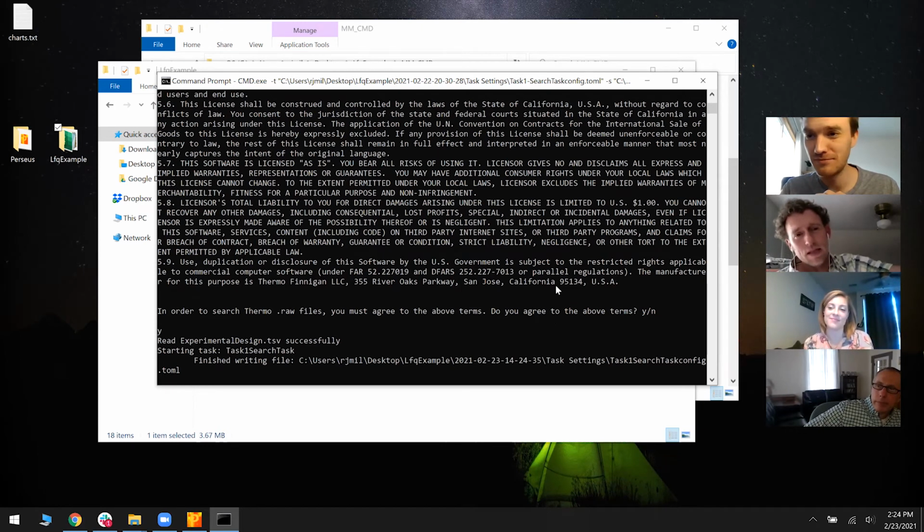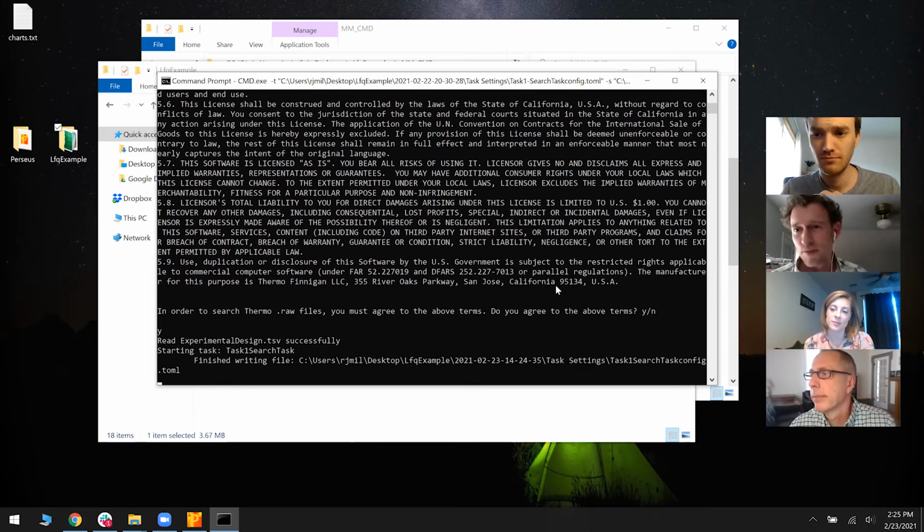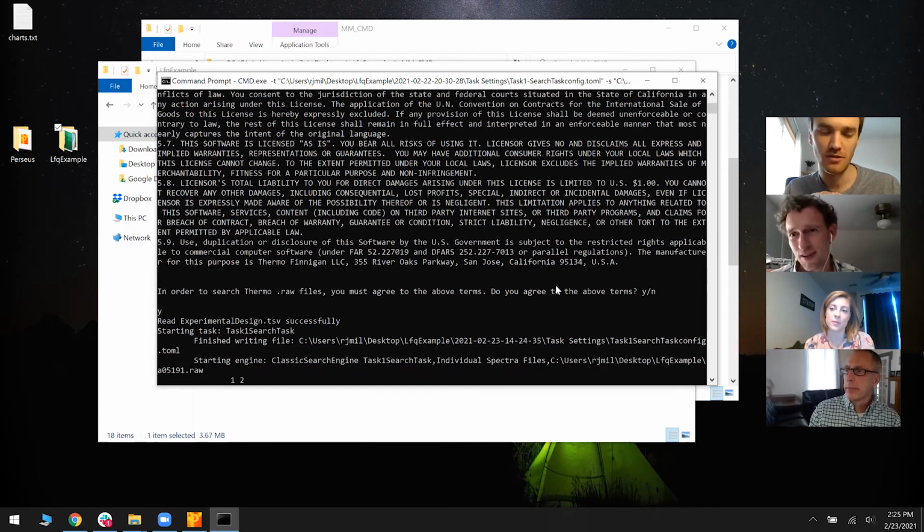Right, and so, you always got to think about who's the audience? But if I, for some reason, was... I think about Jetstream, because they have Linux VMs for free, right? Or free, sorry, subsidized is the word they want you to use. But let's say I wanted to use somebody else's resources to run 100 files, this is the way I would use MetaMorpheus in a Linux environment, right? Just to crank through stuff. Close. I'll show you a couple of options for Linux in a second.